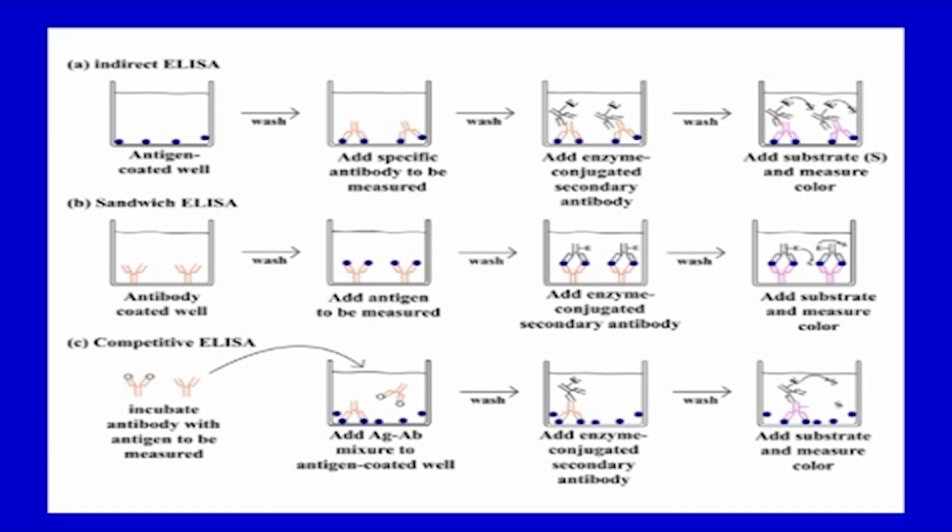Depending on the concentration here and the known concentration, you can quantitate, and in qualitative terms you can evaluate or measure the signal, and finally the antigen concentrations. So, these are the 3 forms of ELISA techniques.